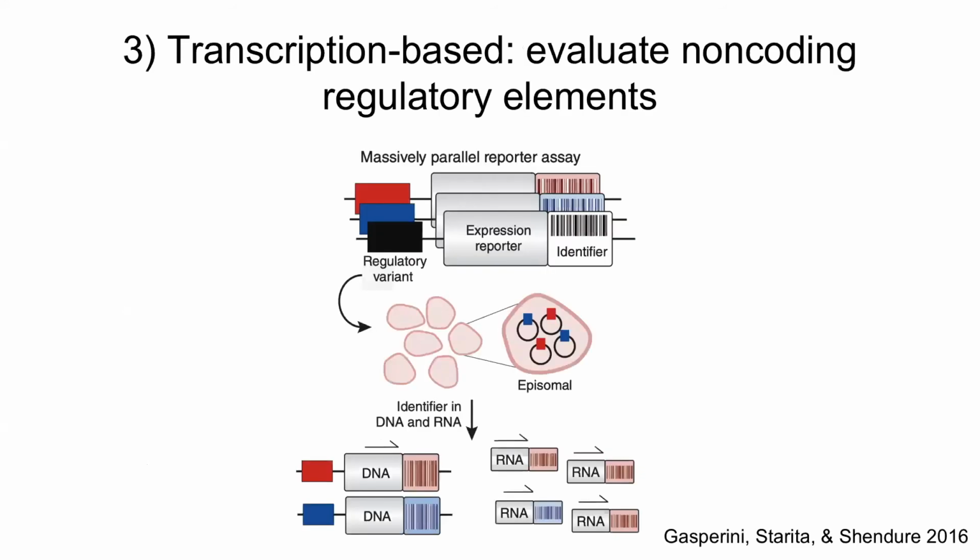And then we just wanted to end the transcription-based section by giving a quick shout out to transcriptional readouts in the category of evaluating non-coding mutational scans. For simplicity, we didn't dive into these, but instead of using the reporter promoter to read out some cellular signal coming from a protein library, these are just mutationally scanning, say, the promoter itself or an enhancer of interest or a series of those elements.